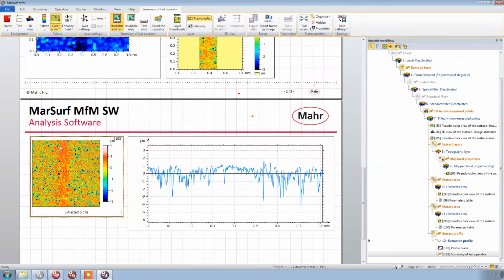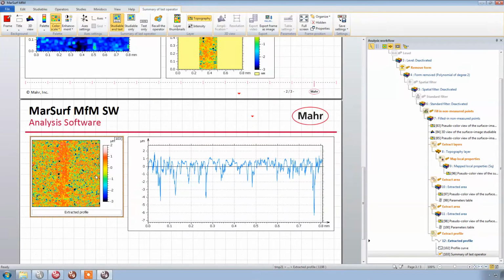But if you didn't have this chart on the left as reference, you may not see it. If you've seen a lot of profiles and you knew what you're looking for, you might be able to pick that out. But then we can move up here and there's really not too much to see. You would have a tough time if you just had this profile, it was all you had to show me. You would have a difficult time convincing me that something different is happening here from over here.